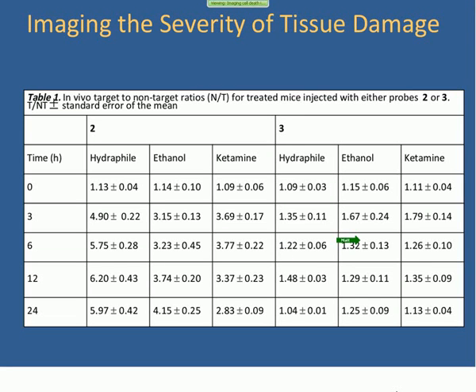When we just look at the dye alone, then we get very low uptake, and it's basically at or near 1.